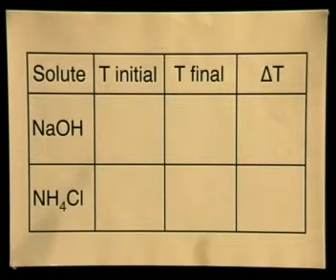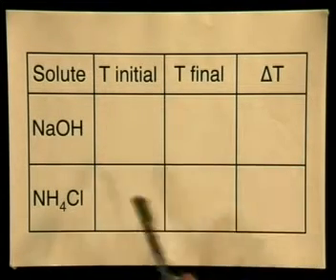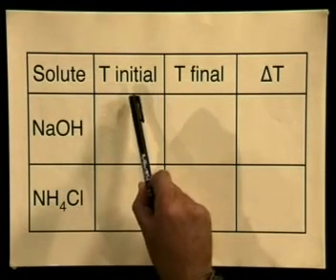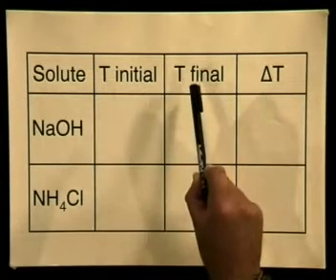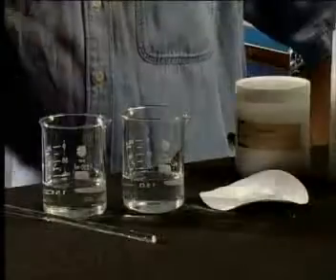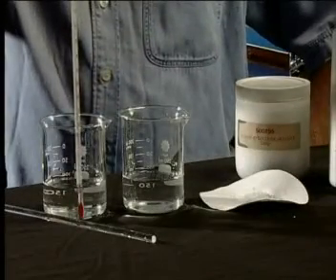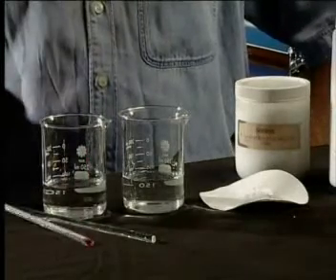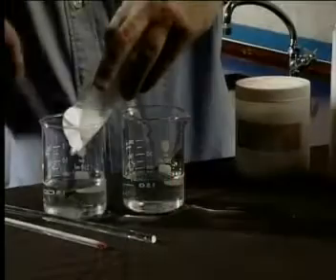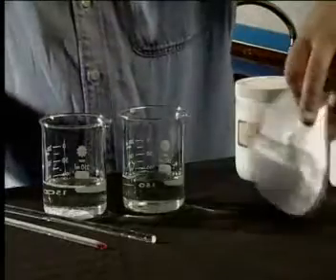The dependent variable will be the temperature change. Let's draw up a table to record our results. Whenever you carry out an experiment, make sure that you draw up a table before actually doing the experiment. We need to record the initial temperature before adding the solute and the final temperature after all the solute has dissolved. The temperature of the solvent is 26 degrees Celsius. Now I will add the sodium hydroxide to the beaker and stir with the glass rod until all the solute has dissolved.